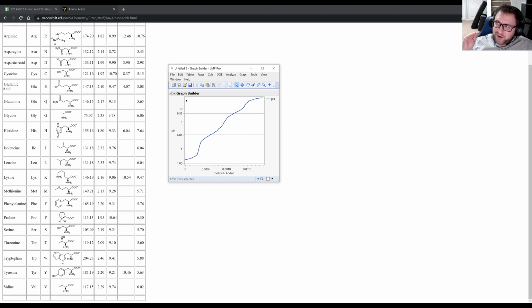So going from 10 to 11 is fine. Our titrant is around pH 12 something. So going from 11 to 12 suddenly gets into the magnitude of our titrant, and it's very hard to titrate up to our titrant. We would have to completely dilute our sample with titrant, which we can't do.